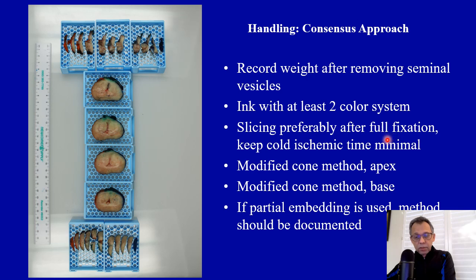when the prostate is removed from the patient and it comes to the lab for fixation, that time should be minimal, which we call cold ischemia time. If your cold ischemia time is very high, then it can potentially have an effect on some of the molecular as well as protein-based analysis for prognostic markers.